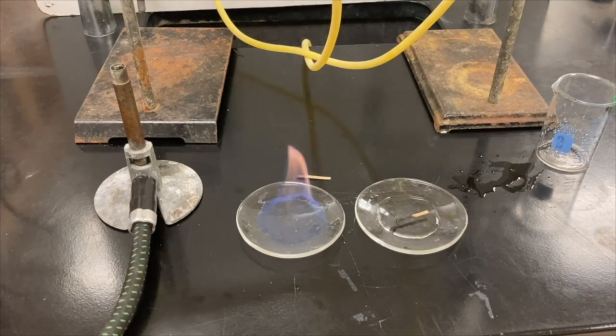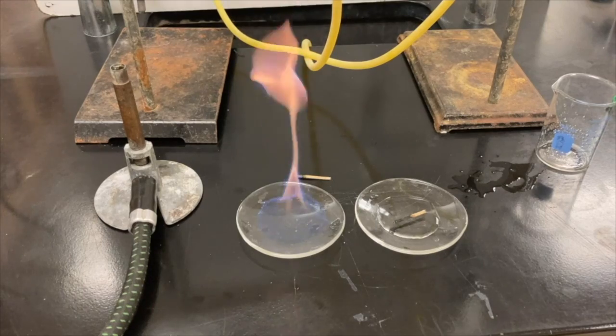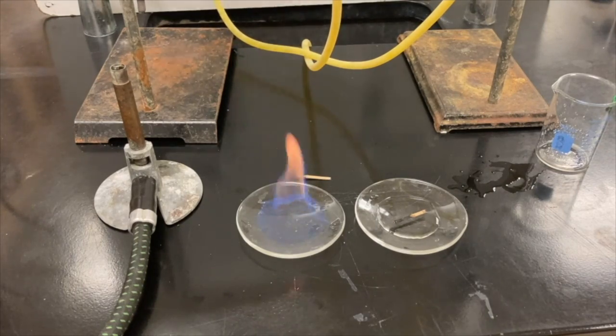So this distillation worked. It separated the ethanol from the water effectively by making use of the fact that they have boiling points that are quite different. So the ethanol all boiled, and after that was condensed, the water began to boil later.